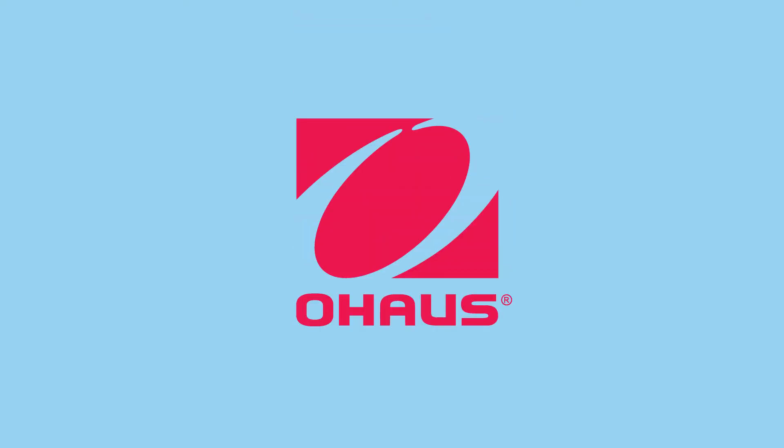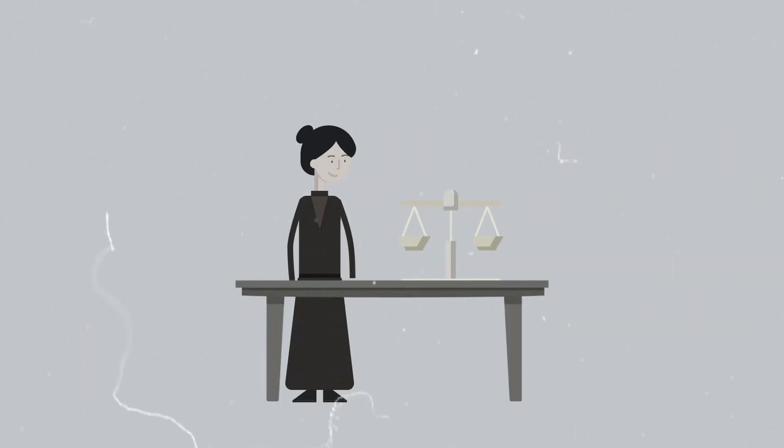For over 110 years, OHAUS has been a trusted supplier of precise and reliable balances and scales. Building on over a century of experience, OHAUS has incorporated the newest technology and advancements to improve products and meet the needs of the laboratory market.